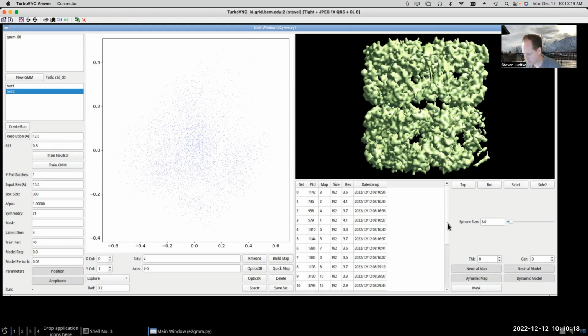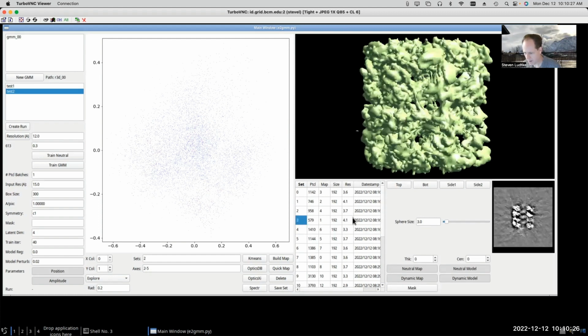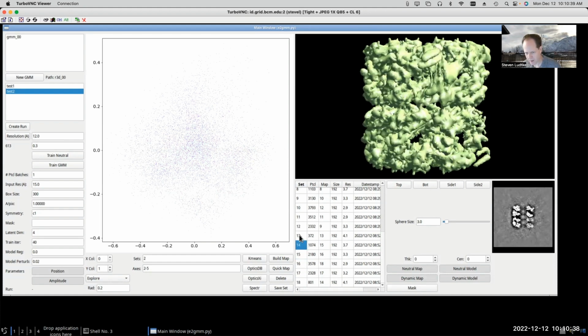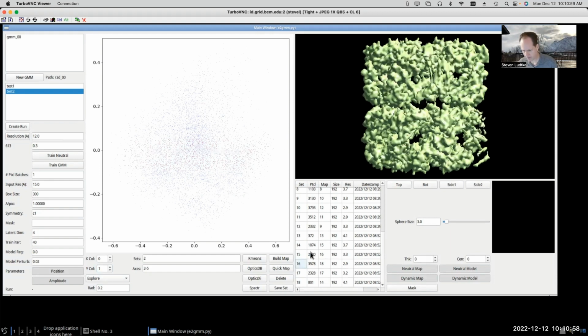I did classification a couple of different ways here. So I did just a k-means classification on the entire subspace. And then I also made some manual classes here. So here you can see I have these bands through the data. So how did I make these horizontal bands? Okay, what I did is I plotted axis for basically 0 versus 0, or I could have used 1 versus 1. Actually, in this case, it was 1 versus 1, I think, right? Okay, so let me turn this off and explain a little bit more.